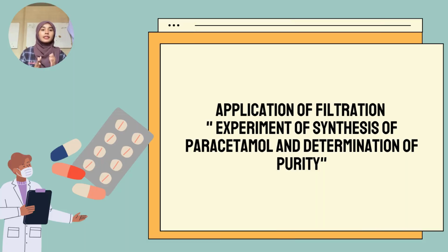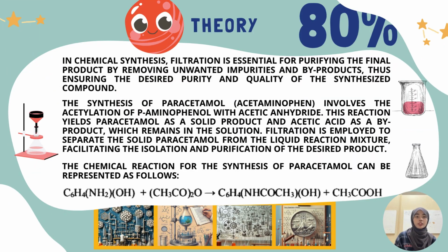Now, let's discuss the next topic, application of filtration in the experiment of synthesis of paracetamol. First, the theory of application of filtration in the synthesis of paracetamol. Filtration is a mechanical or physical operation used for separation of solid from liquid or gases by passing the mixture through a filter medium that retains the solid particles while allowing the fluid to pass through.